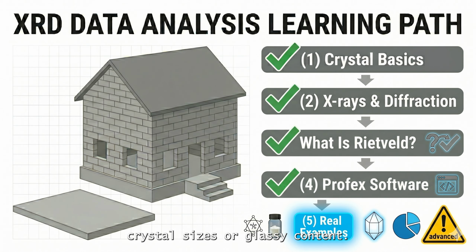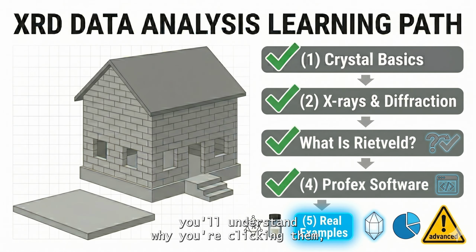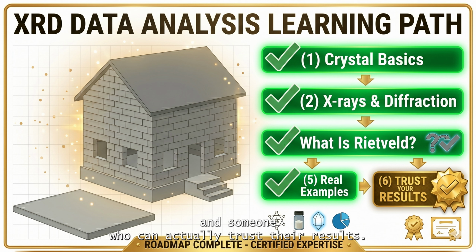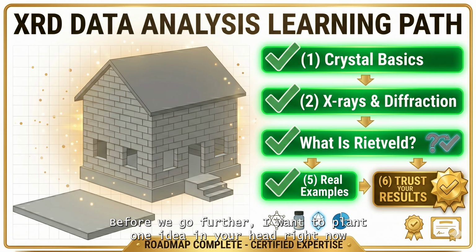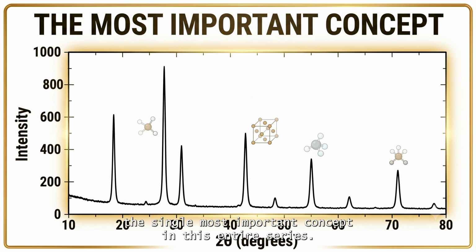or glassy content. By the end, you won't just know how to click buttons. You'll understand why you're clicking them, which is the difference between someone who can run software and someone who can actually trust their results. Before we go further, I want to plant one idea in your head right now. The single most important concept in this entire series. Everything else is just details on top of this.